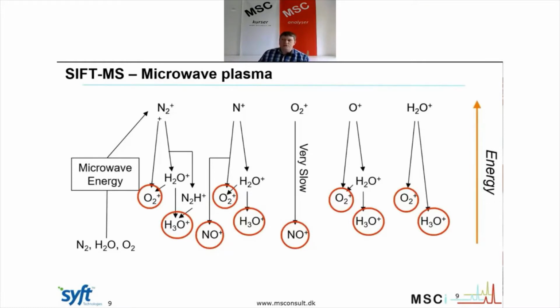Then you bombard it with microwave energy, where you excite the molecules, and then they fall down to the different ions that we are using.